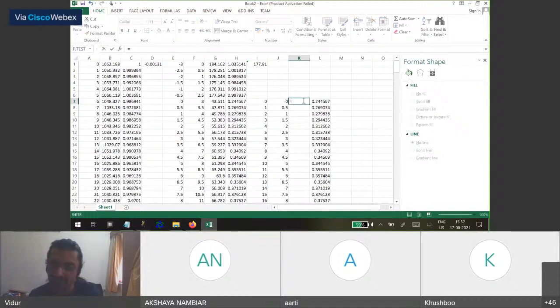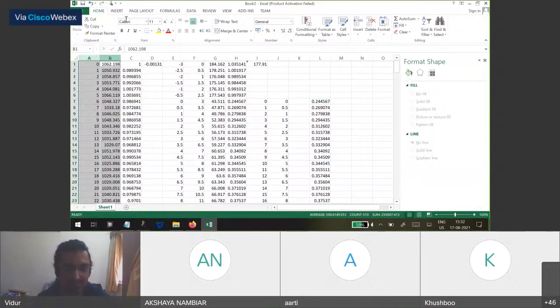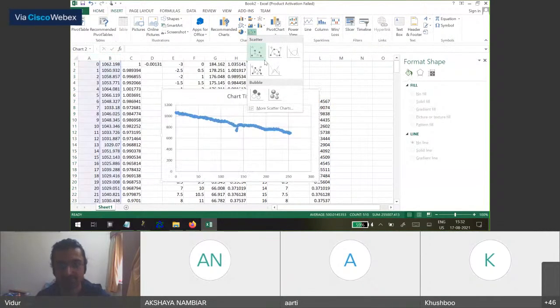So you just put equal to this intensity plus this intensity. Sorry, this will be minus this intensity because this is a negative. Okay, I'll just go over this once again because this can get confusing.